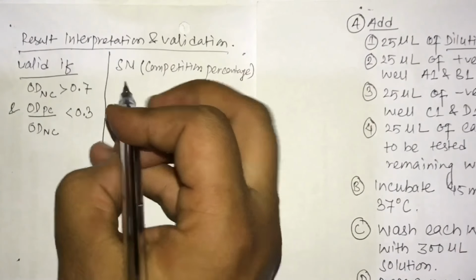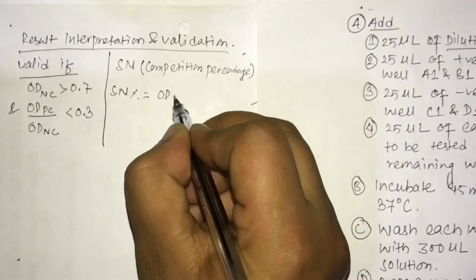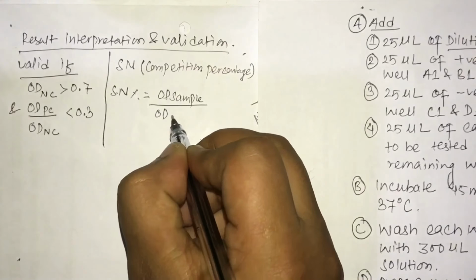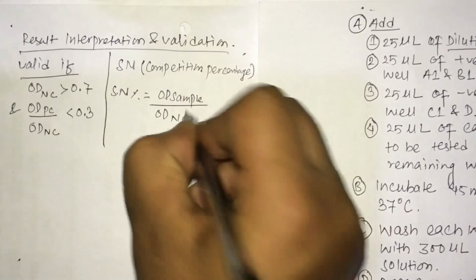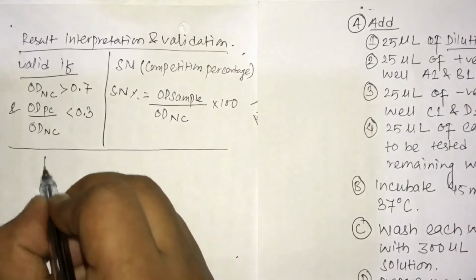Now we will be computing the competition percentage, which is calculated as the optical density of the sample divided by the optical density of the negative control, multiplied by 100. This is expressed in percentage.